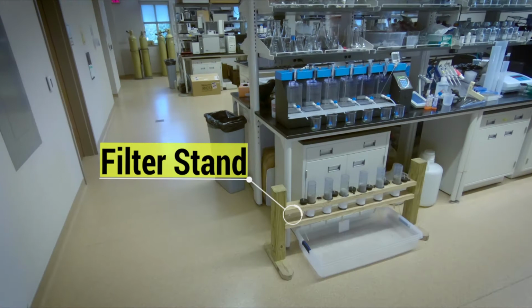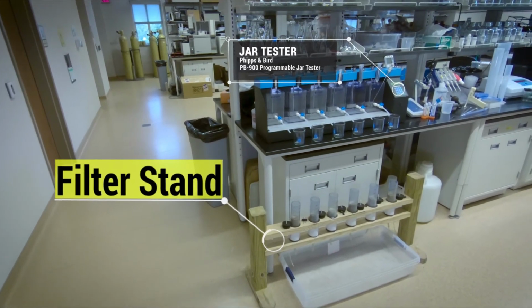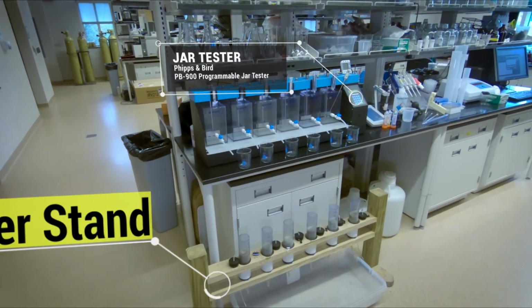Now that we've covered the basics of jar testing, let's get into how to conduct a jar test and a list of items you'll need in order to get started.